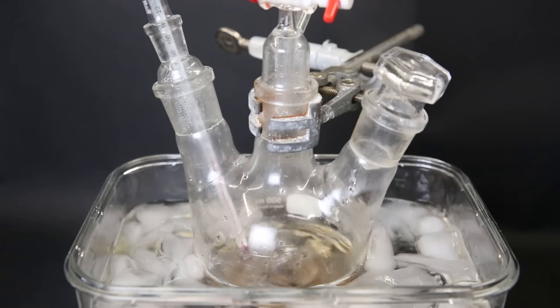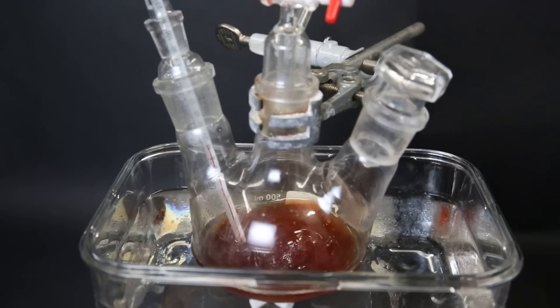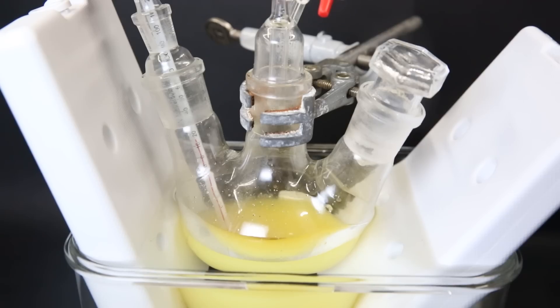For this reaction, it is very important that it is stirring strongly because the acid and the toluene are immiscible. If there is not enough stirring, the reaction will not work. So I slowly add in the acid mixture and also make sure that the temperature doesn't increase too much. During the reaction, the mixture turns red, and when it is finished, it will turn yellow.